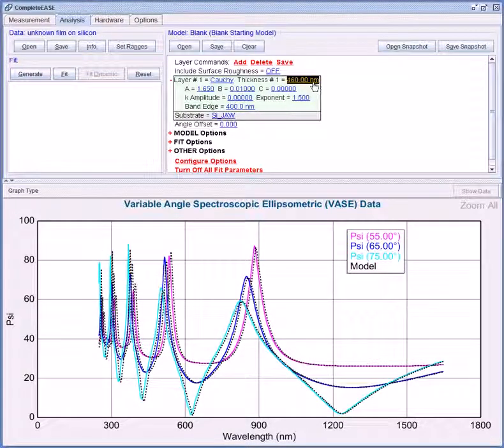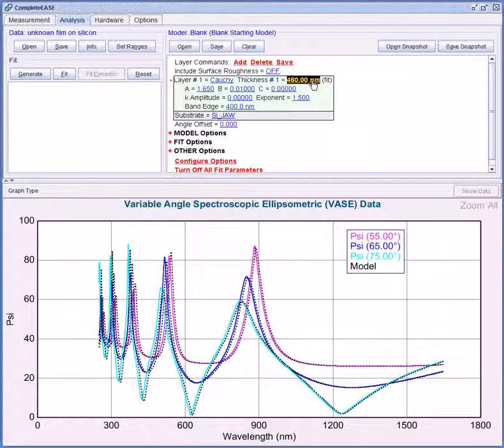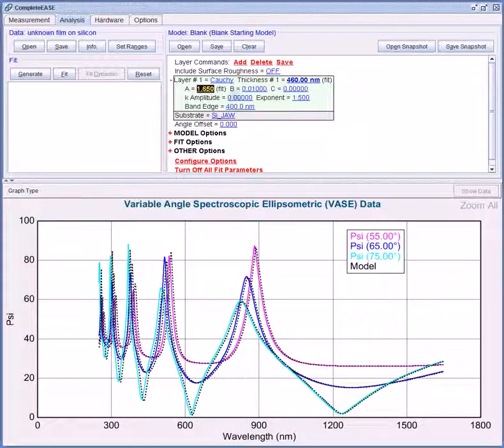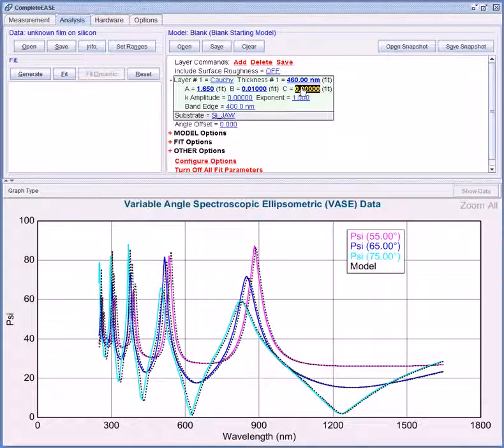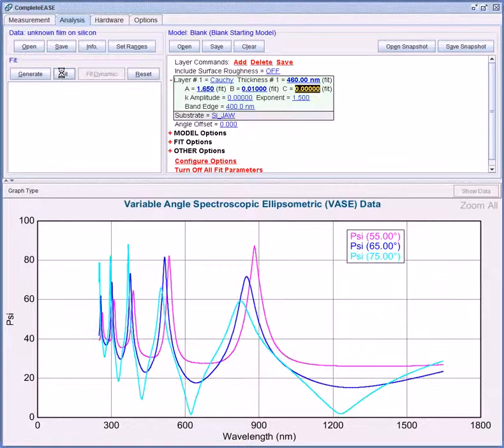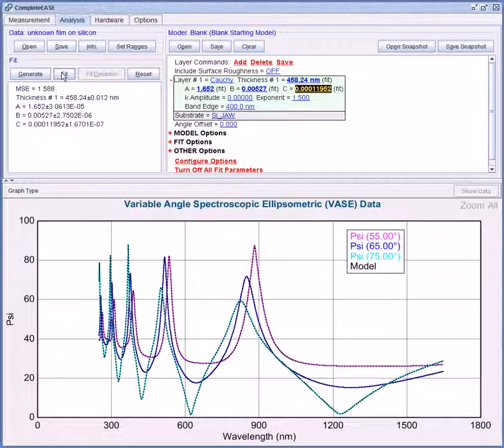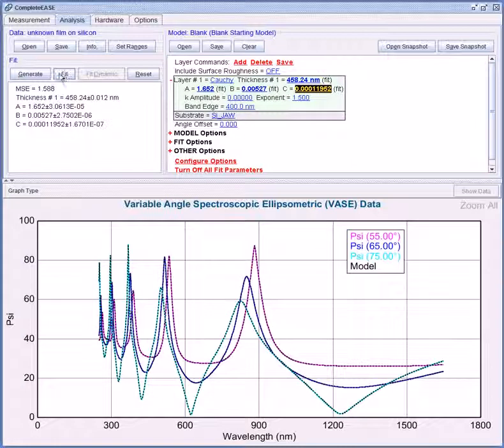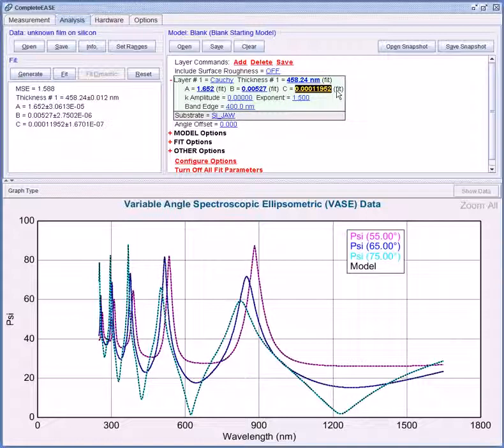Now I can turn on my fit parameters, right click on thickness, A, B, and C, and press fit. Now the software algorithm adjusted all of these values to find the perfect match between the model and the experimental data. The results are shown here in the fit panel.